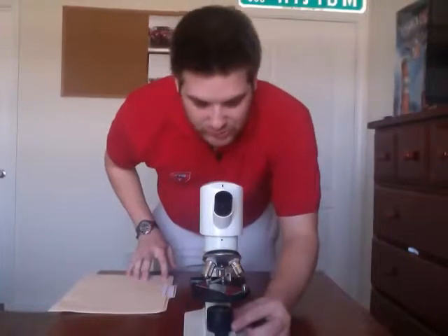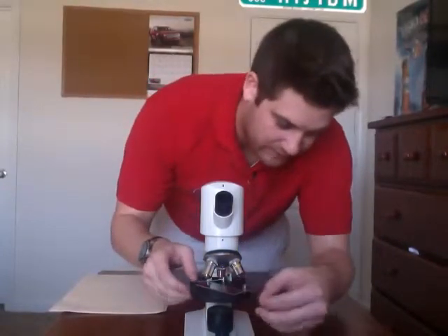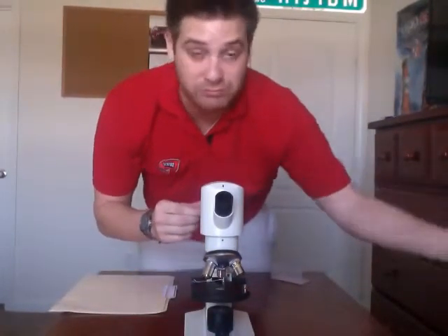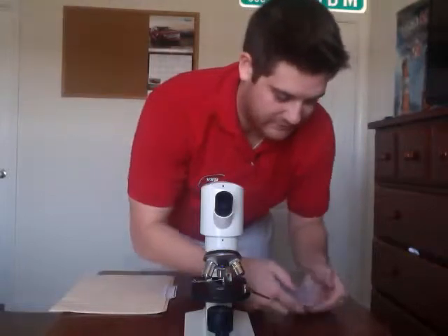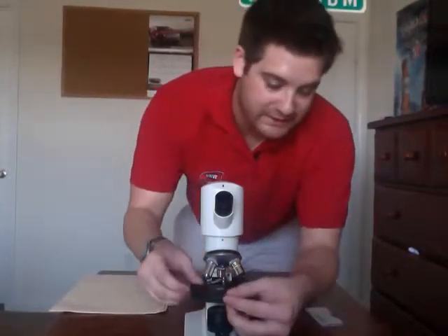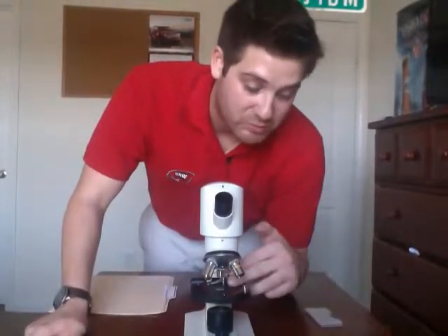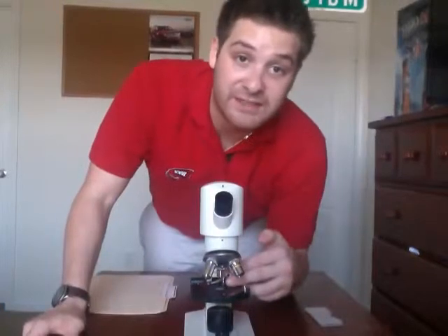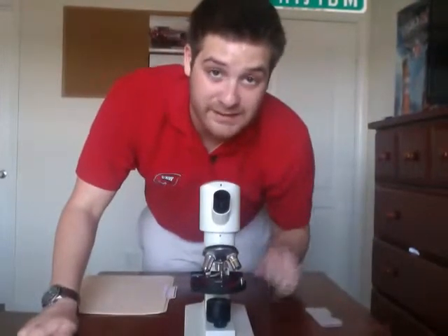And always remember, when you're done looking at your specimen under the microscope, be sure to always clean your slides for the next group or next class that's doing the same experiment. Always keep these things clean. You want to rinse off whatever you had on there, any residue or anything. And once you've cleaned your slides, you want to make sure that you clean your microscope as well. Maybe the platform has some debris, or some of the stuff that fell off of the slide got on the platform. Make sure everything is clean and tidy on the platform. And make sure you turn off the light before you unplug it. That's a big thing.